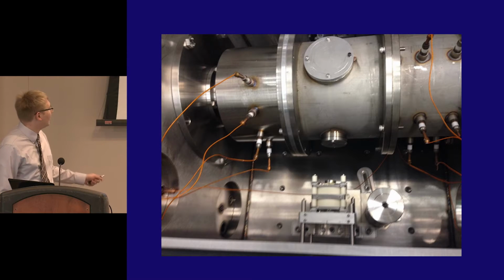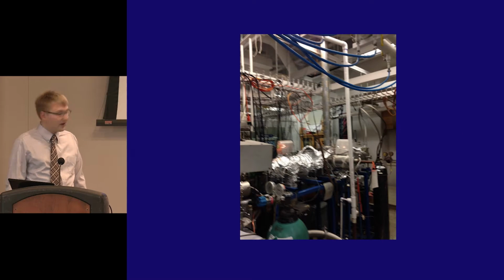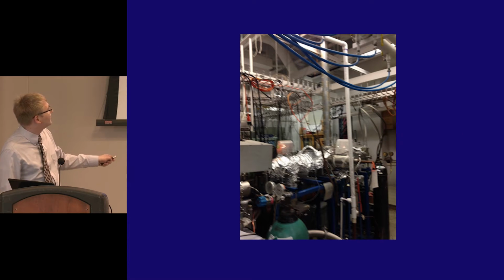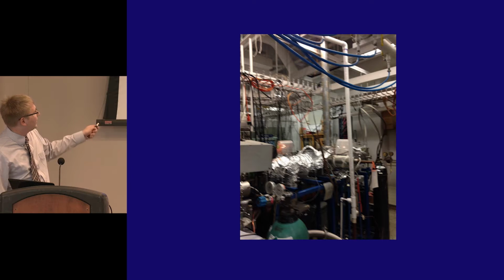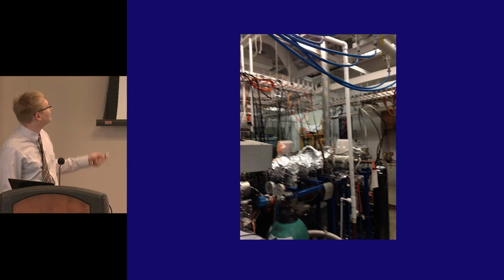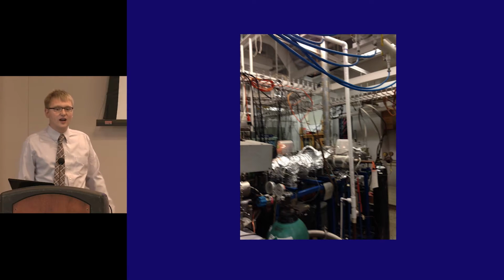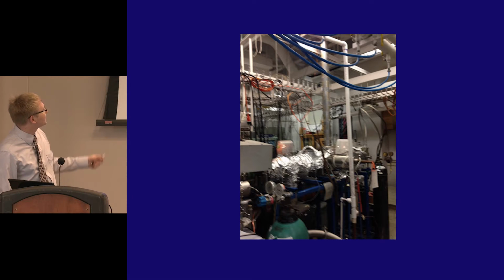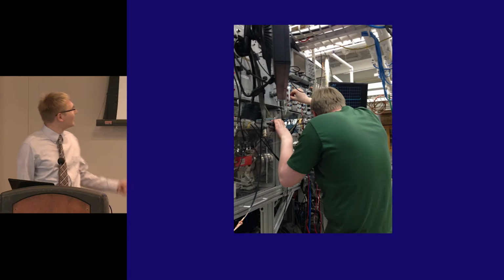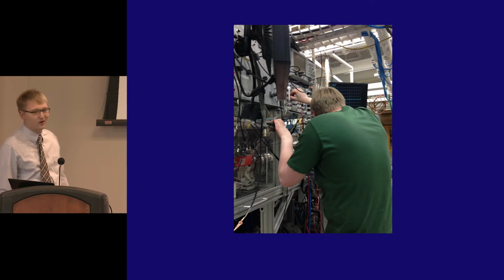So here's a picture of the ion trap installed and ready to run. And this is where the magic happens. This is the photoelectron spectrometer. This here is the magnetic bottle. It's about 6 feet tall, so as tall as I am, sticks about 10 or so feet up into the air. And this is where we do the energy analysis and make the photoelectron spectrum. And here I am, hard at work, tuning up the beam power on our new source.